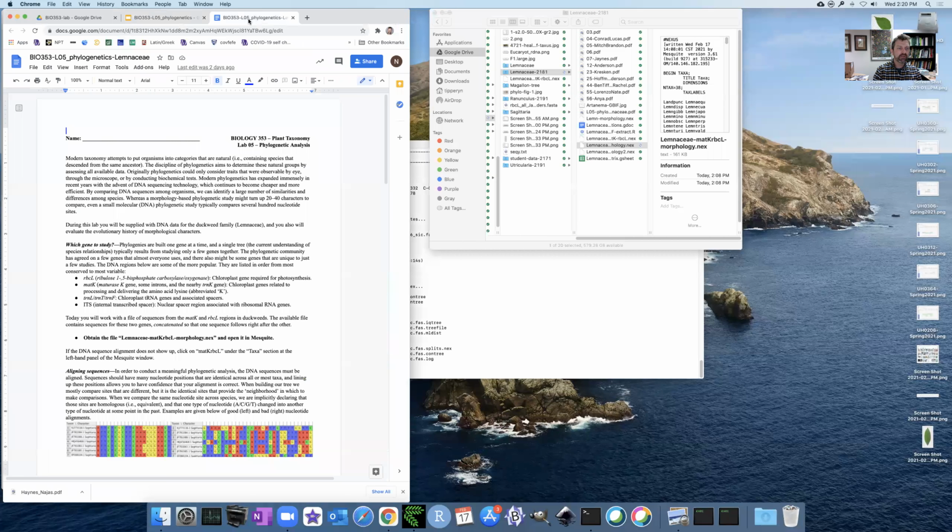All right, so I'm just going to keep going into the exercise for today. I think it's probably easier for me to just demonstrate the exercise. If you want to follow along, I'll show you the process of getting the software and so on, show you where to look for that. Everything on this you should be able to do on your own, but given that it involves a little bit of a niche computer program, and it doesn't always work for everybody, it requires JavaScript and so on. And sometimes there's a bit of a learning curve to doing the steps here. I'm going to leave it up to you if you want to do this for yourself, or if you just want to watch me do it on the video.